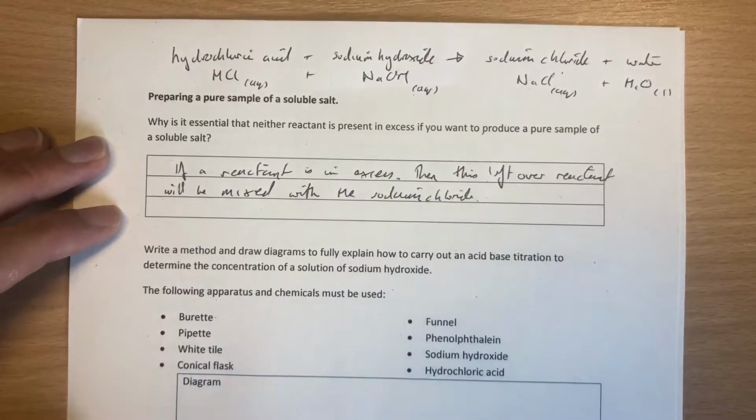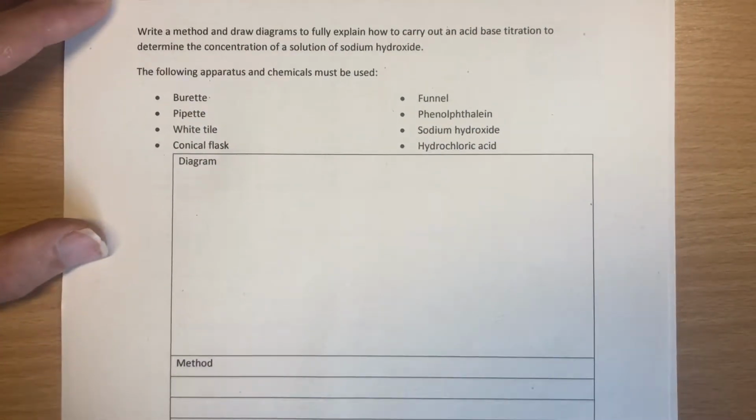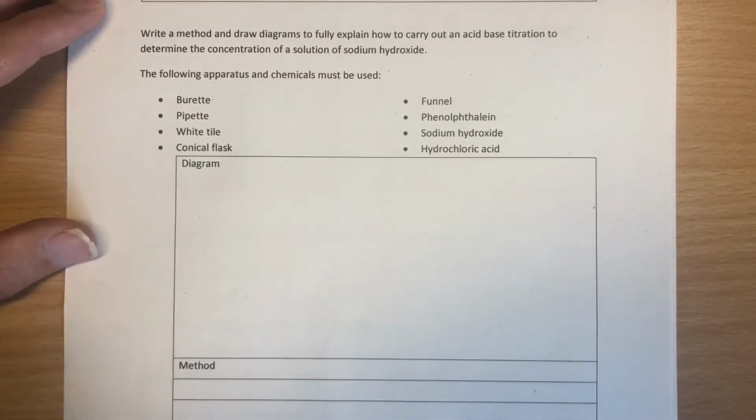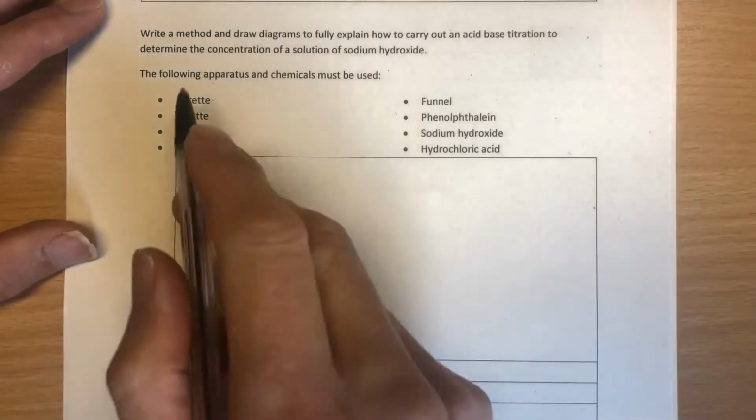Now we're in year 11. We come back to titrations again because they're very useful things to do, because with a titration we can work out really quite accurately the concentration of an acid or an alkali if we know the concentration of the other one, by doing a titration, working out exactly how much is needed, and then doing a calculation. So this is a big part of year 11. This is what we're going to talk about now.